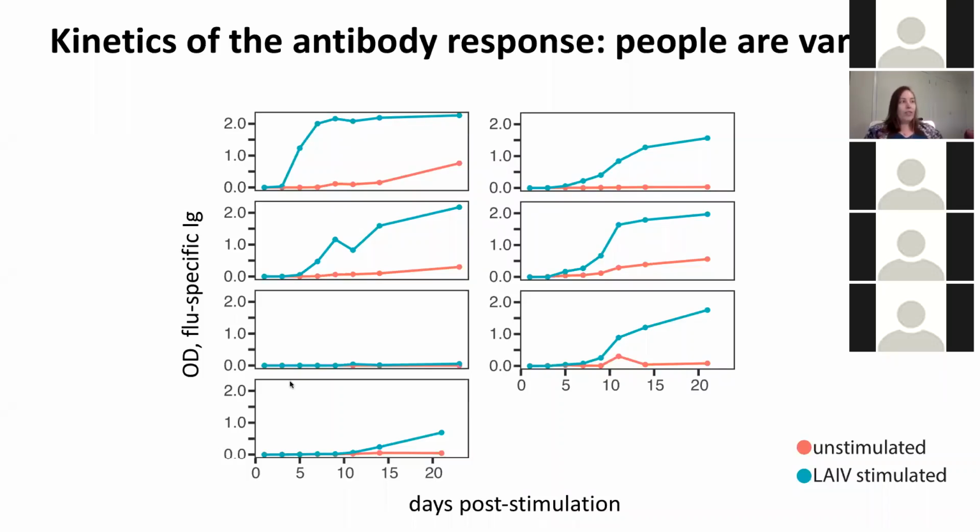Yeah, so for example, this donor takes daily inhaled corticosteroids. And so there's a possibility that that immune modulation that they've been receiving as treatment for their inflamed tonsils is actually resulting in a poor antibody response. So you can imagine that the clinical history of the donor, their flu exposure history, their age roughly might correlate with that as well. So I imagine we could even break this out by individual strains and see how they respond to the different strains contained within the vaccine as well.